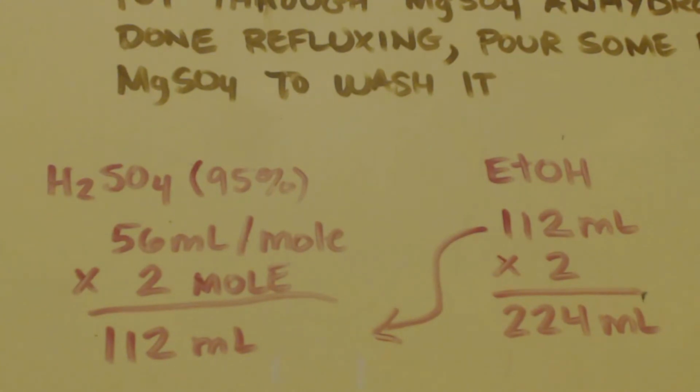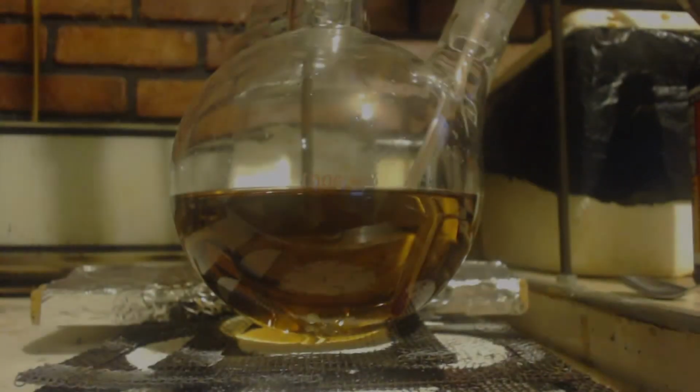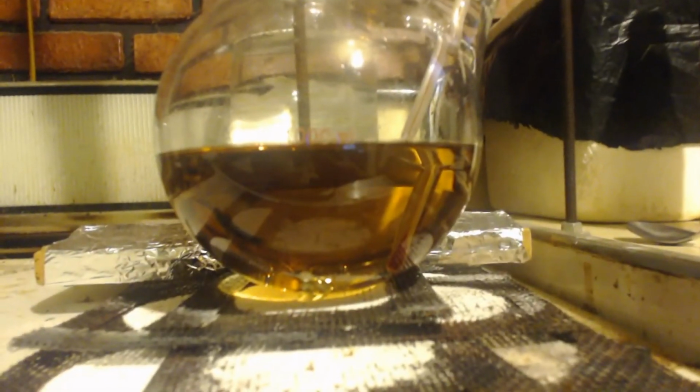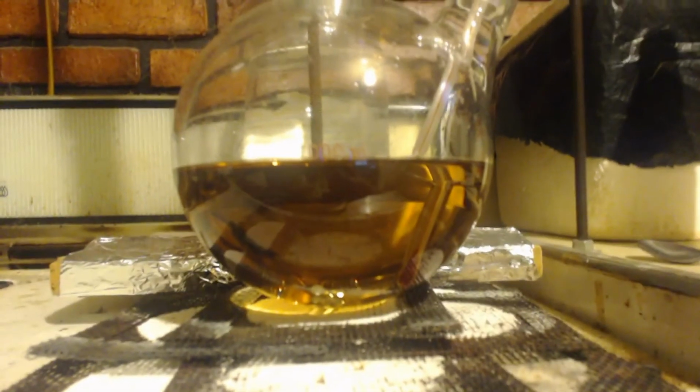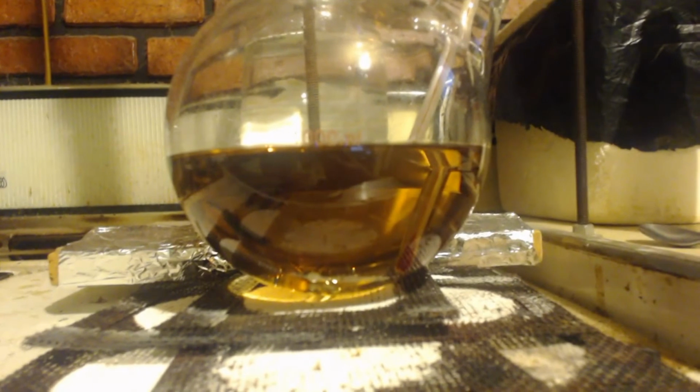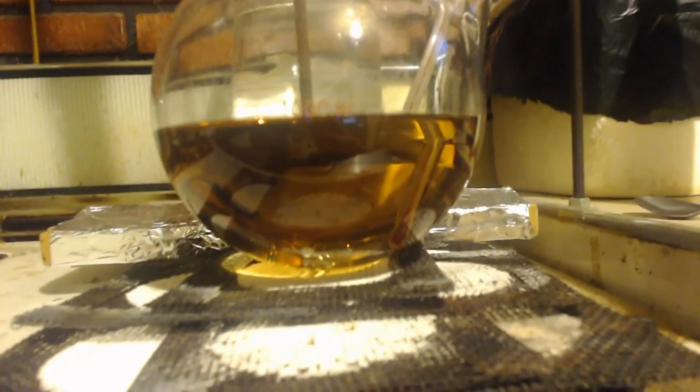And I'm not going to do that because I want to see what happens, how much of a loss I get just from doing it without doing anything to the sulfuric acid and only distilling the ethanol, and that's it. Just distill it. Don't dry it up better than an azeotrope. Let's see what happens. You know what I mean? So here's our ethyl bisulfate, and during the refluxing, it turned from clear to yellow, kind of like urine, to this orange color, this orange-brown color.